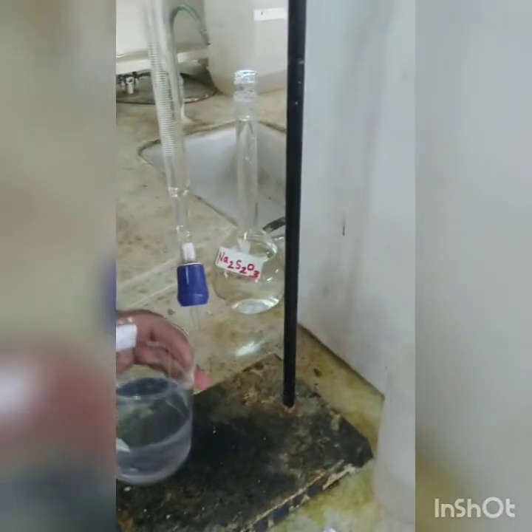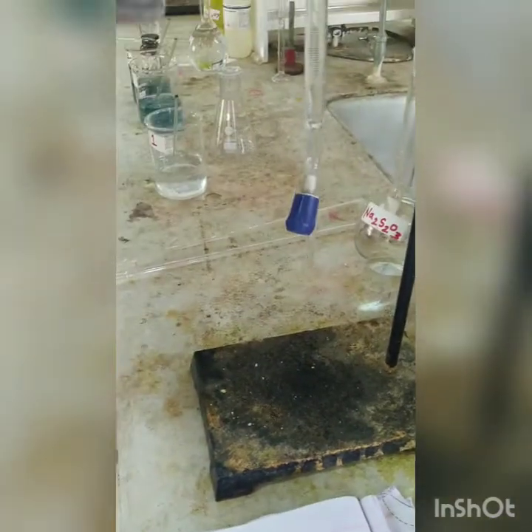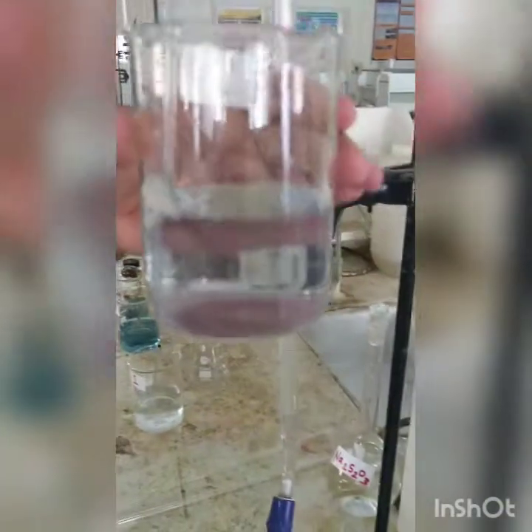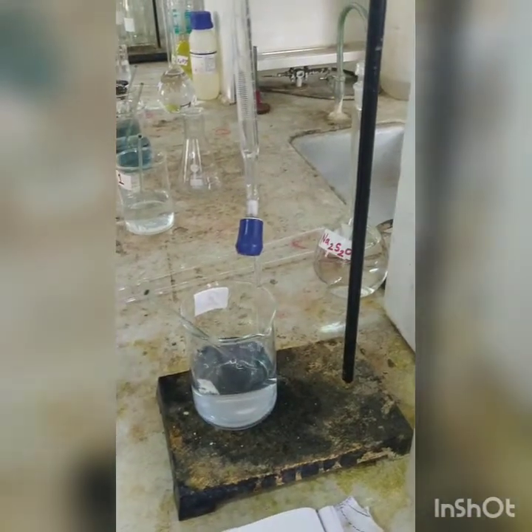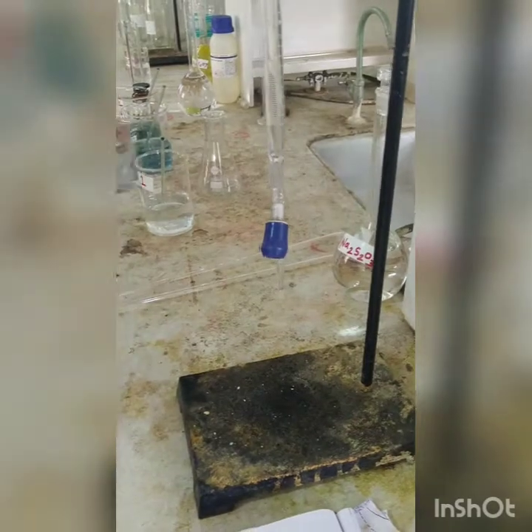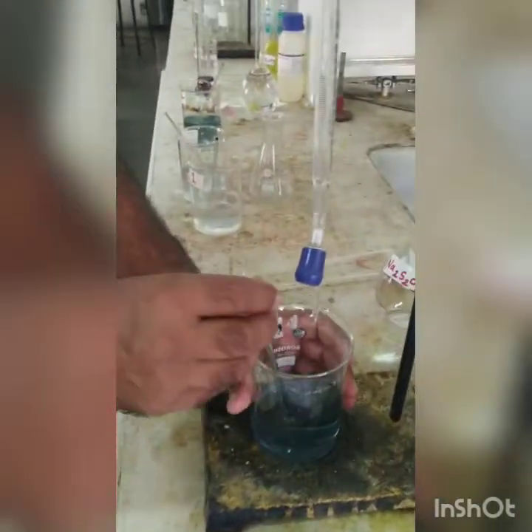Yeah, still some bluish tinge is there. Okay. How much is the reading? You subtract 2.2 and tell me. 4.5. Now the third beaker, you are starting from 4.5.